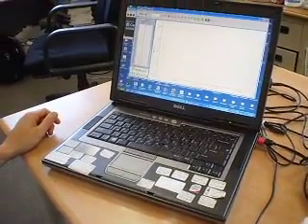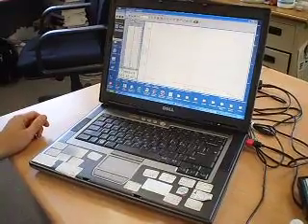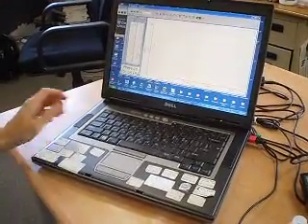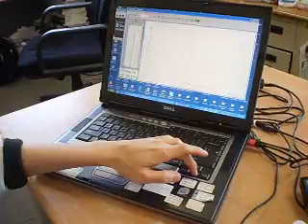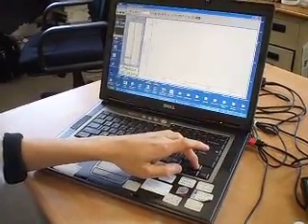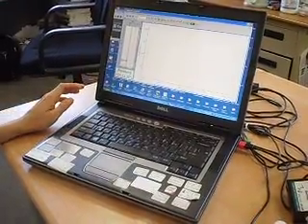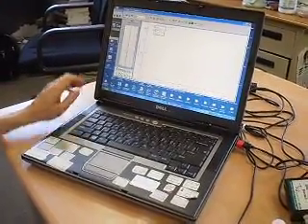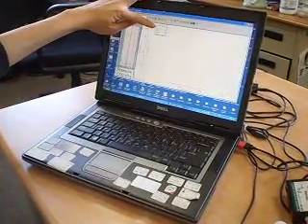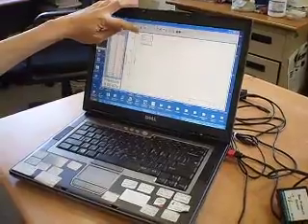When I analyze my data for my first run, I look for the time where the reaction starts. The reaction starts at 30 seconds. Bring my cursor here. Highlight 30, where the reaction starts. Click on it.